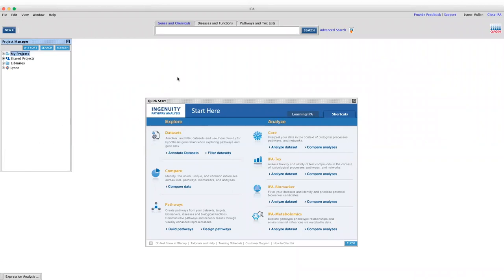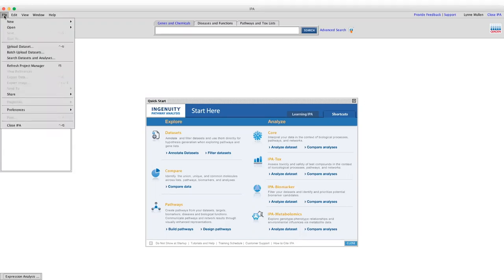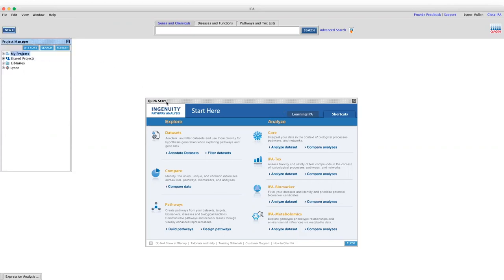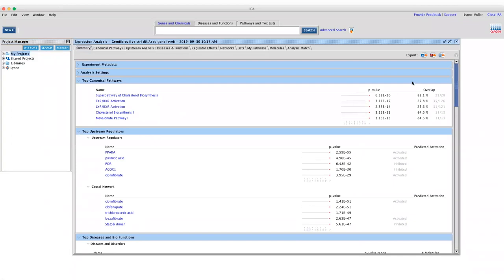Now let's go into IPA. Here I'll briefly go over the welcome screen. We have a menu where you can begin analyses or upload your data set, a New button for many of the same functionalities, a quick start screen in the center with analysis wizards, and a project manager on the side with a My Projects section where all your data sets and analyses are stored. I've already uploaded the data set, ran the core analysis, and opened it — so I'm going to maximize that now.